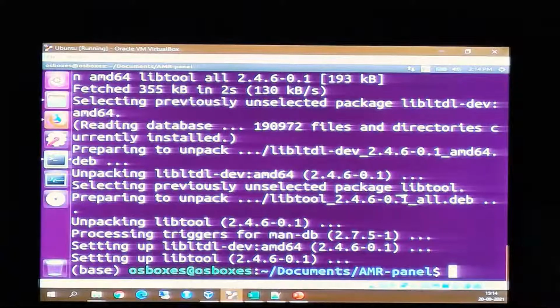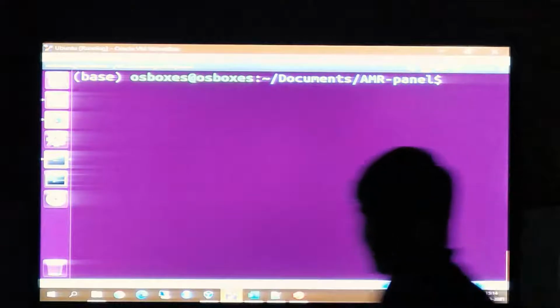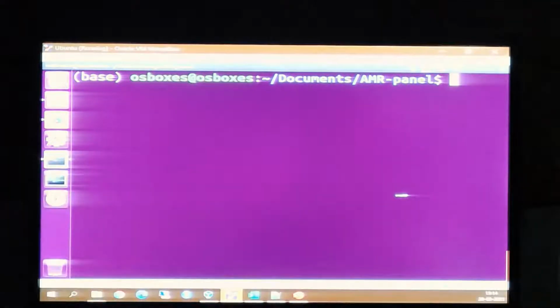Readme MD, yes. That's the memory. You need to remember ORF first, that first one. Copy the last word symbol. You click it, click copied. Now you paste it. Everyone, Control C.